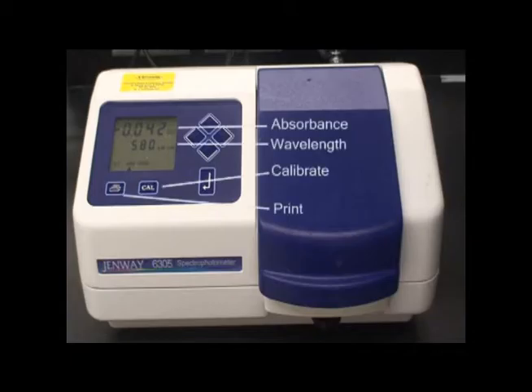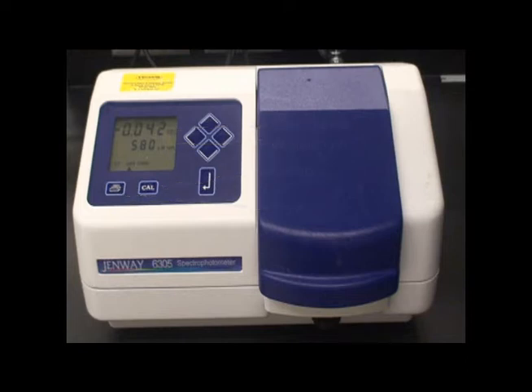Seen here are some common buttons on spectrophotometers. The wavelength of light, currently set at 580 nanometers, can be adjusted with the arrows.